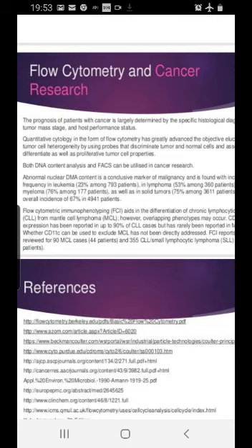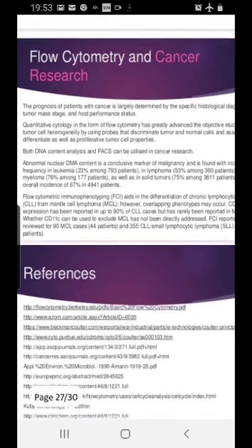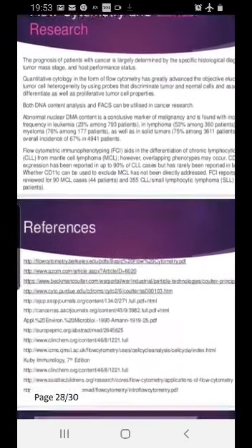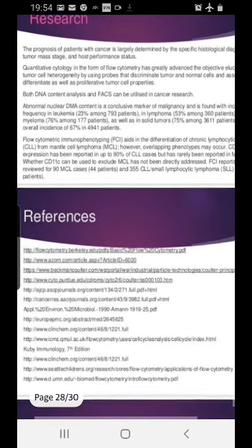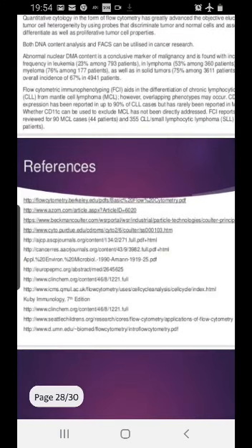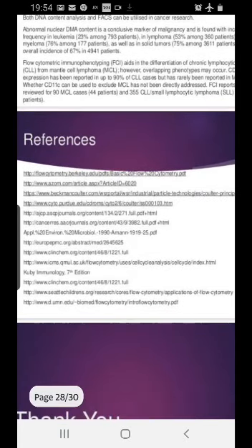diagnostic feature. It is very commonly used to differentiate between CLL and mantle cell lymphoma. In CLL, the morphology is almost similar to MCL, but CLL is positive for CD5 and CD23, whereas mantle cell lymphoma is positive for CD5 but negative for CD23. This is how you differentiate between the two. But sometimes MCL will still show some weak positivity towards CD23. In those cases, we use cyclin D1, which is specific for mantle cell and will be negative in CLL. So this is how it is used in different conditions, particularly in hematology, leukemias and lymphomas.